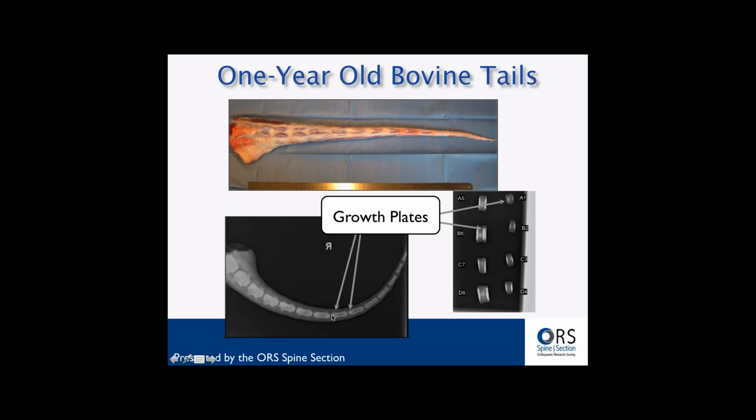And be careful when you have these animals from the slaughterhouse. First of all, you need to test that these cells are really alive, that you get the tails fresh enough. And then some animals still have the growth plates present. If you have these growth plates present for the organ culture after cutting, they can block the nutrition and you will have a decreased cell viability. So we cut it away, and make sure that this is cut off properly.